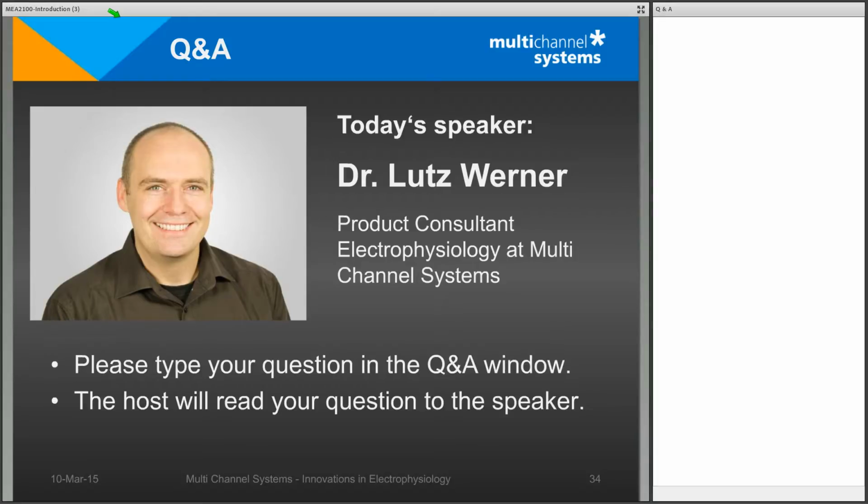Thank you, Lutz, for this presentation. We had some questions about the reusability of the MEAs. Can they be cleaned and reused? Yes, the MEA chips can be cleaned.